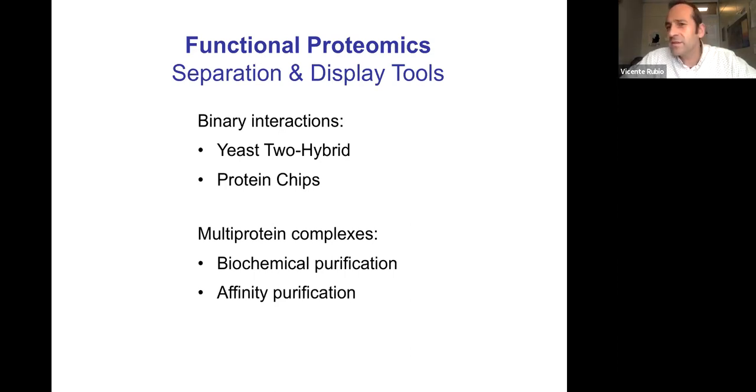But these two techniques have a significant limitation that can be overcome by other techniques like biochemical purification or affinity purification of protein complexes, which allow detection of multi-subunit protein complexes. These are the ones that are more interesting, I guess, for the participants, and I will pay more attention to them, particularly the affinity purification systems.